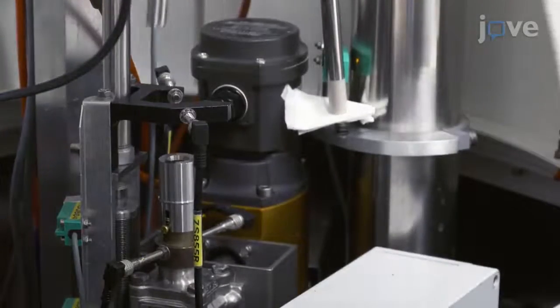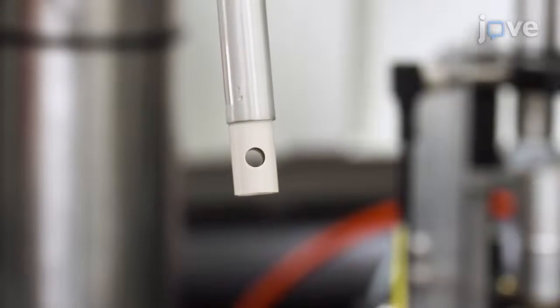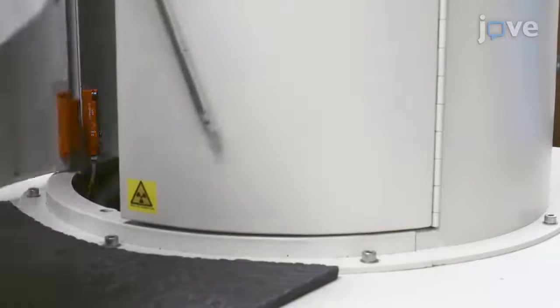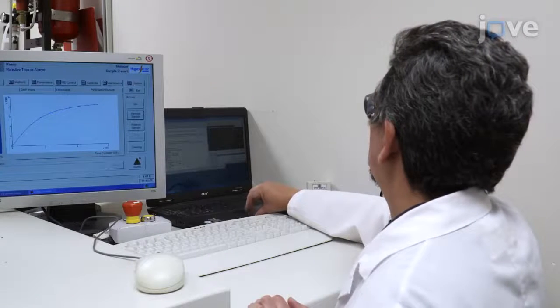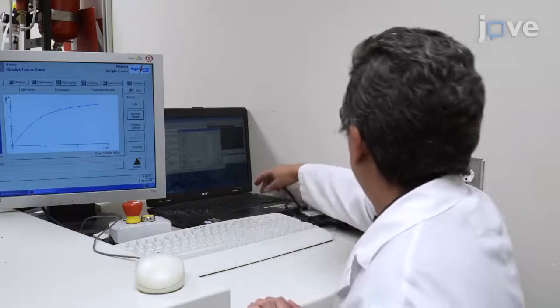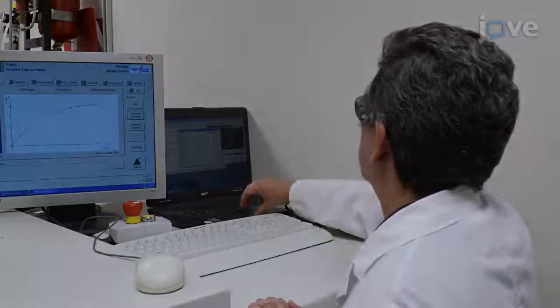Quickly extract the wand, and make sure the cup is released. Then, close the turret doors and allow the temperature of the VTI to return to 1.4 Kelvin. Meanwhile, prepare the DNP to run a microwave sweep in order to find the optimal radio frequency for the hyperpolarization of the stock solution.